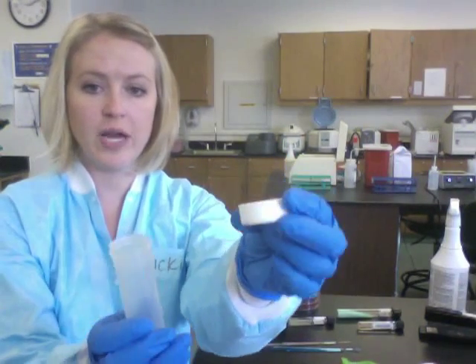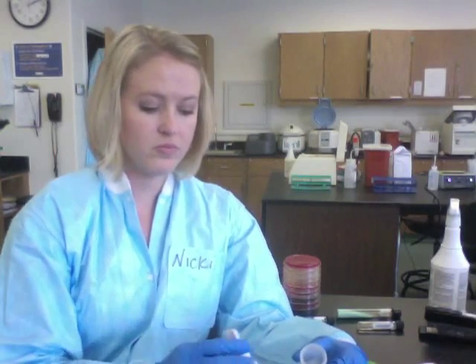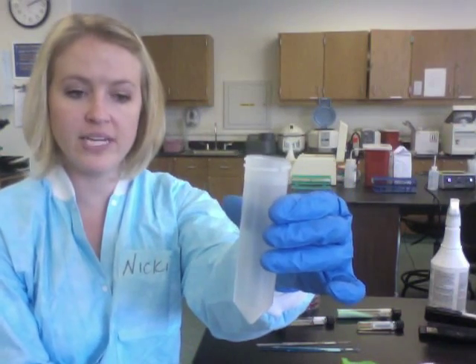You're going to open this up — it just has a screw cap. Set the screw cap down with the inside sitting up. You're going to put some sterile saline into this conical tube, then take a piece of the tissue and place it into the sterile saline.